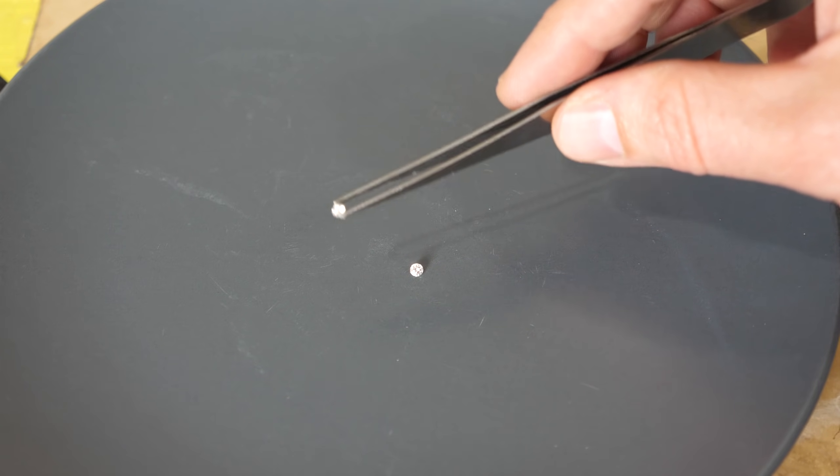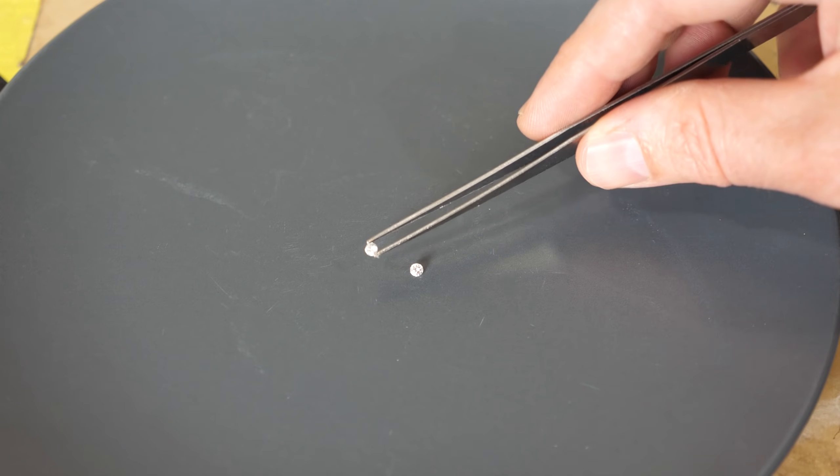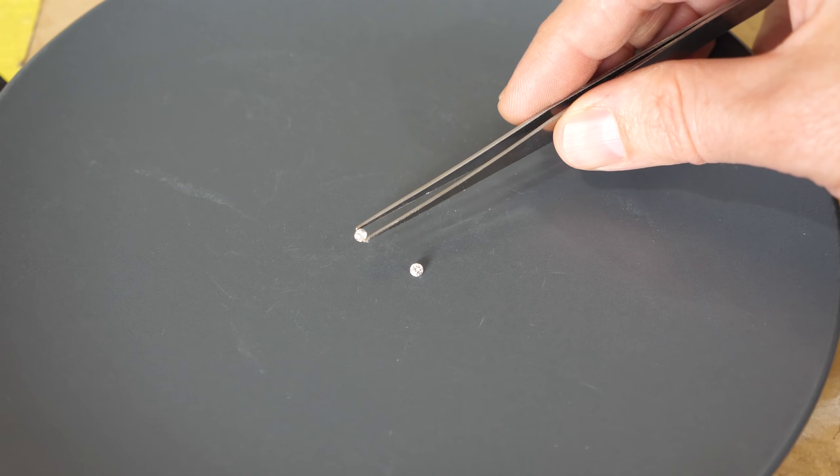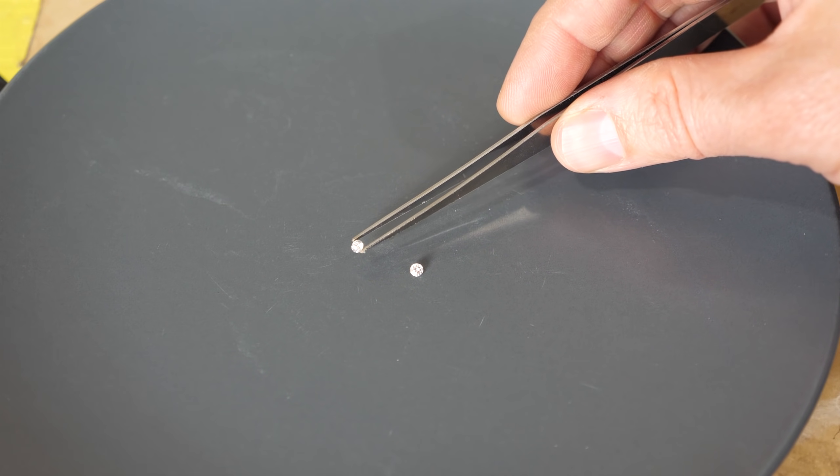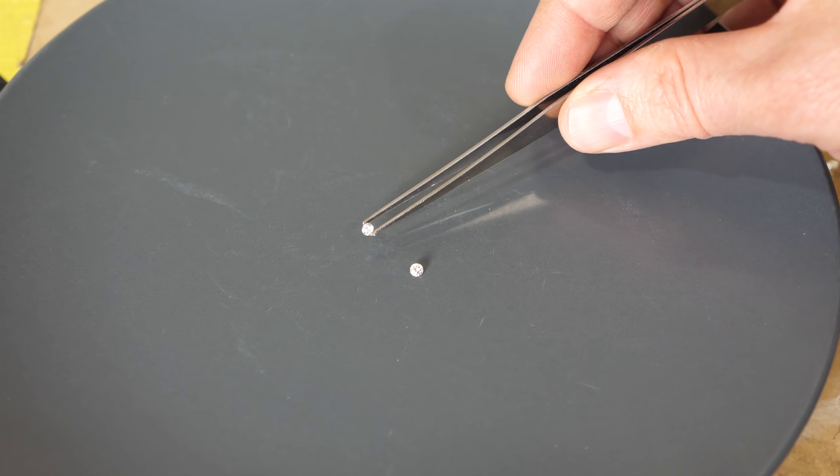Today I'm going to be trying to do the impossible and dissolve diamonds. I have here two real diamonds that were sent to me by a company called Pure at Birth.